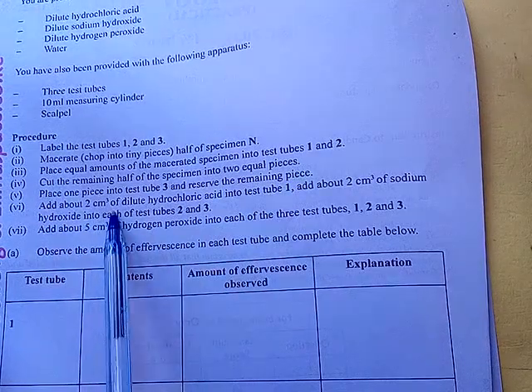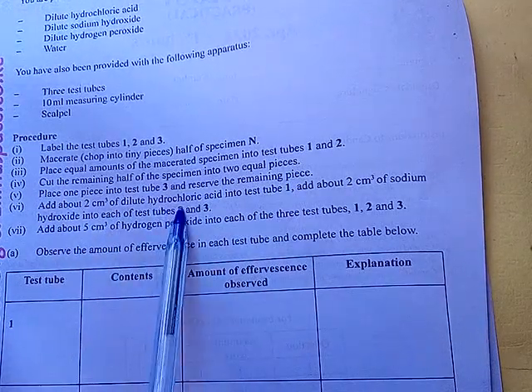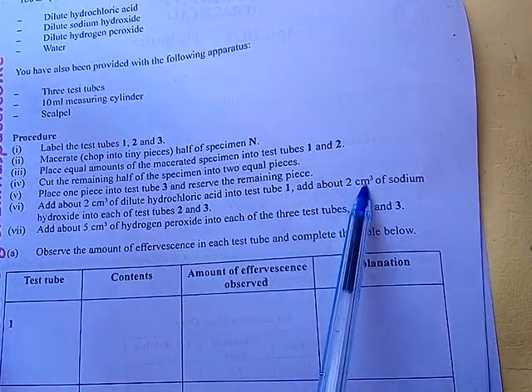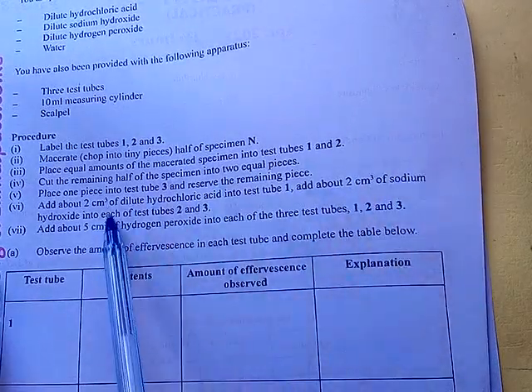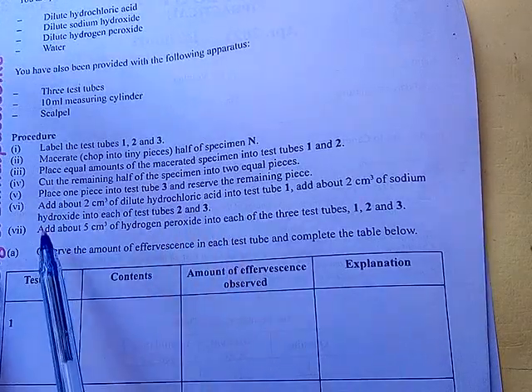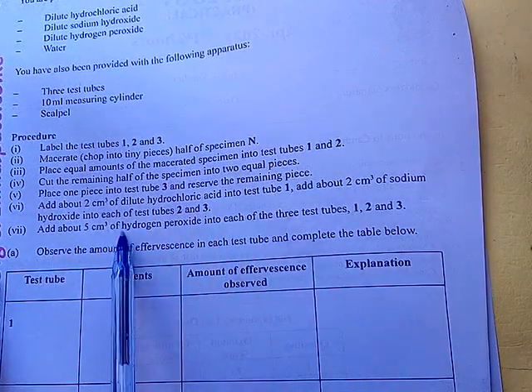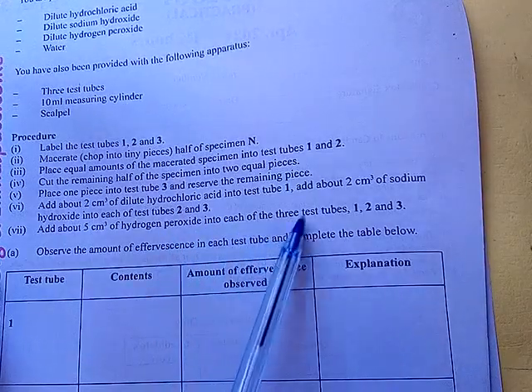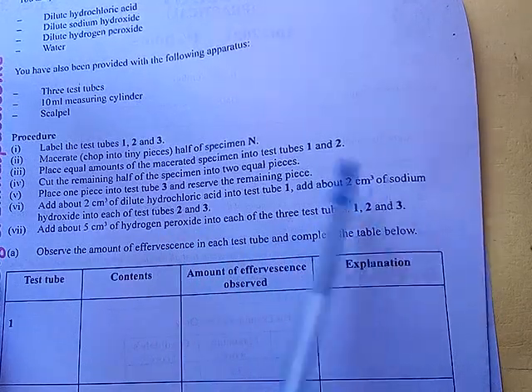Add about 2 centimeters cubed of dilute hydrochloric acid into test tube 1. Add about 2 centimeters cubed of sodium hydroxide into each of the test tubes 2 and 3. Add about 5 centimeters cubed of hydrogen peroxide into each of the 3 test tubes 1, 2, 3.